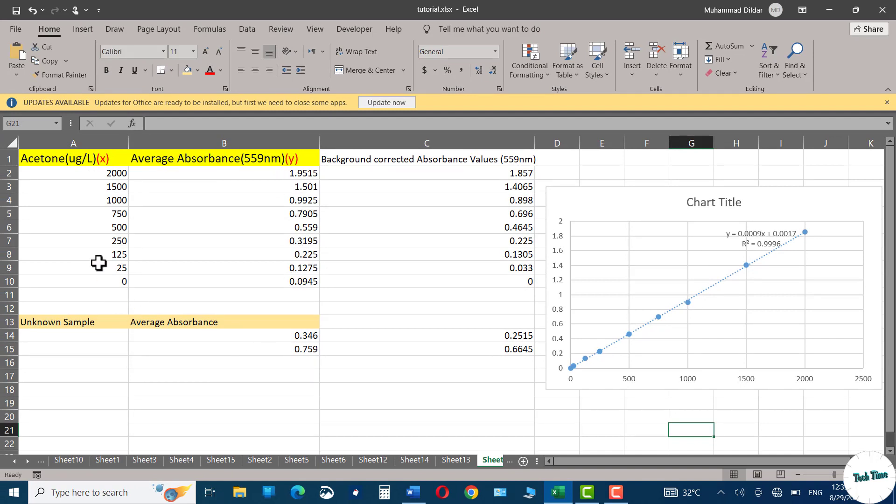Now let's find out the amount of acetone in unknown samples whose absorbance have been calculated as well as corrected for background absorbance.